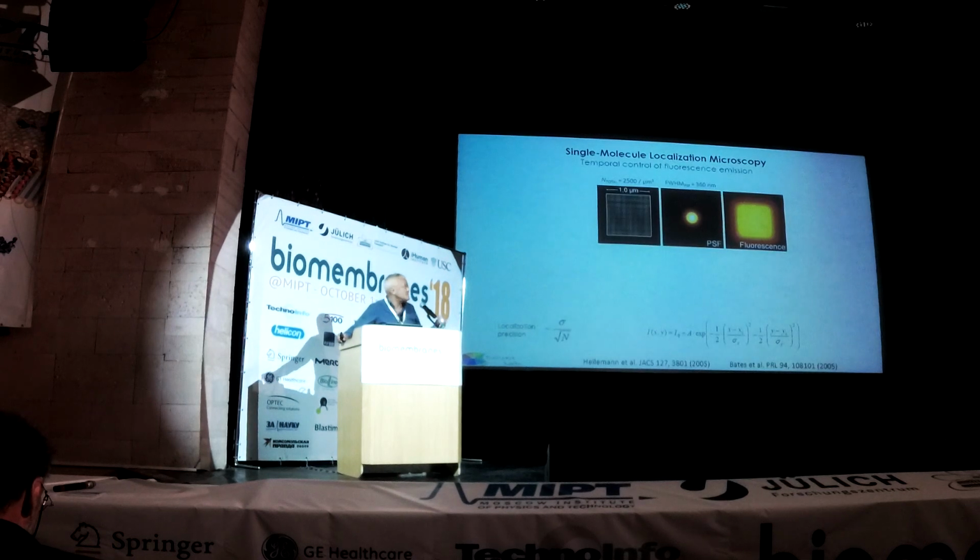So, about 20 years ago, several groups started to find ways to bypass the diffraction barrier of light microscopy. And these efforts have been rewarded in 2014 by the Nobel Prize in Chemistry given to W. E. Moerner, Eric Betzig, and Stefan Hell, and finally.